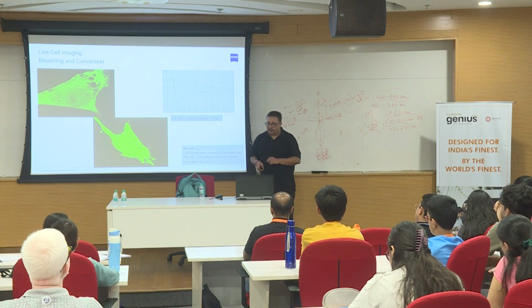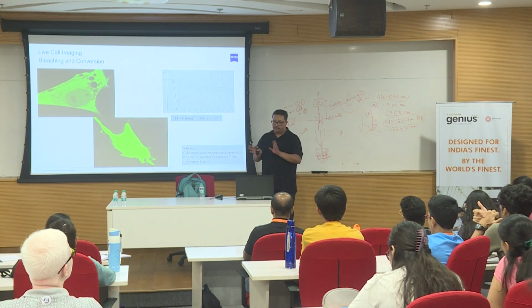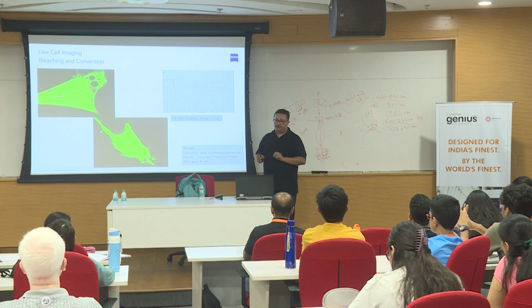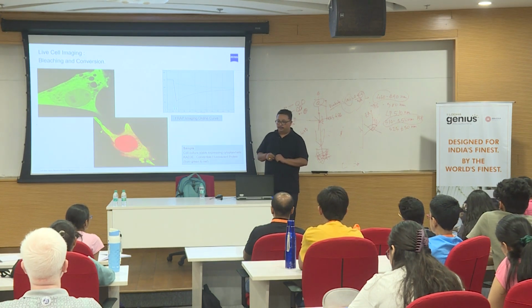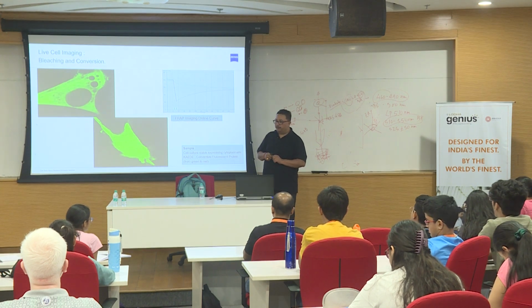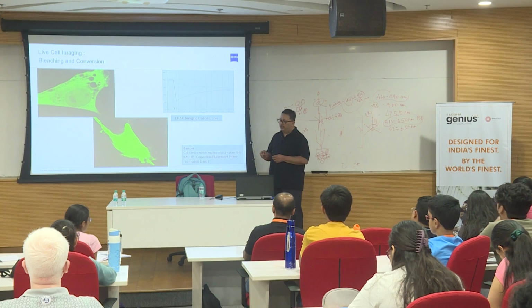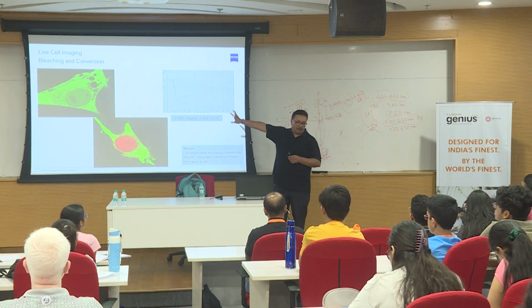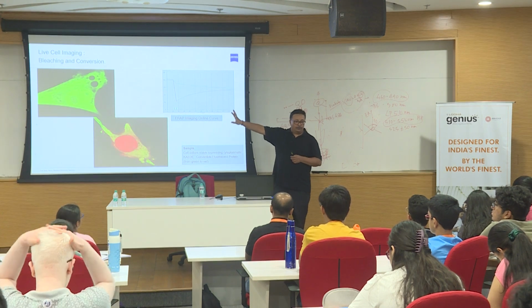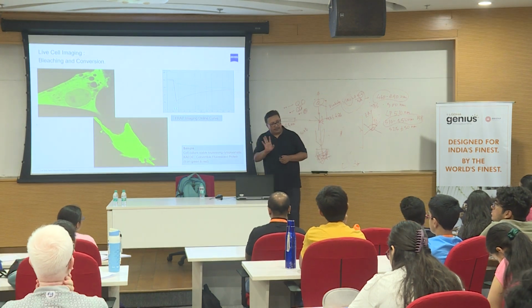So if it is a 640 nanometer excitation, your Z resolution will be close to 640 or 700, and your XY resolution will be 640 divided by 2. So your XY resolution is always 2 times better than Z resolution. 0.61 lambda by NA is the diffraction limited XY resolution. Two multiplied by that factor, meaning 1.22 lambda by NA, becomes your Z resolution. इतना समझ लो, अभी तक यही काफी है.